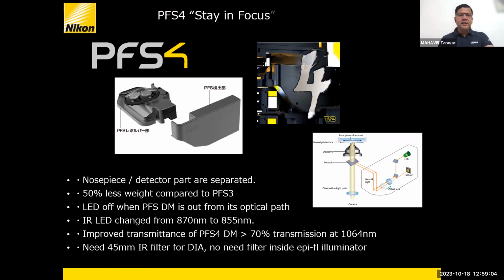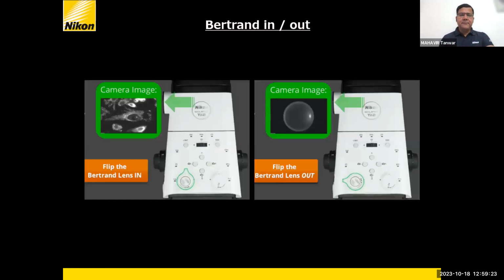So you don't have to worry about long-term live-cell imaging, irrespective of the time you have set up for it. You can keep performing live-cell imaging without having an issue of, let's say, temperature or pressure change. The system takes care of this. So these are the technological advantages and developments happening these days.